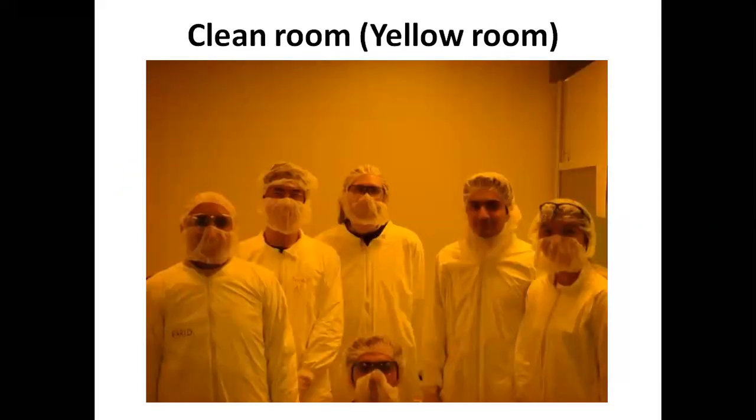This is one of the pictures which I took when I was doing fabrication inside the clean room when I was doing my PhD here at the University of British Columbia. I went to Canada, so I also did some microfabrication in the clean room. This is the manager of the clean room. He was a very hard guy. All the time he was watching us through his laptop, and you could see that we are completely covered.